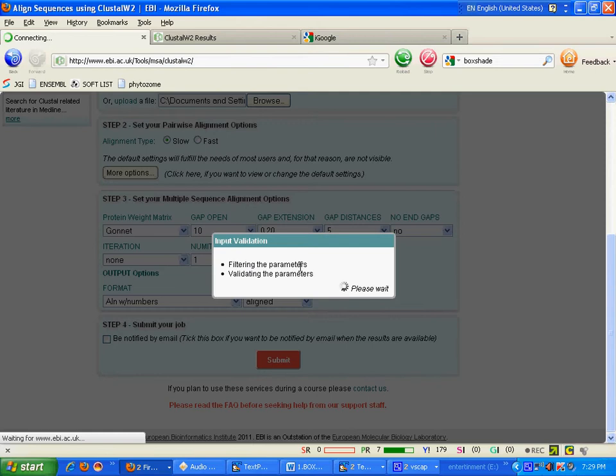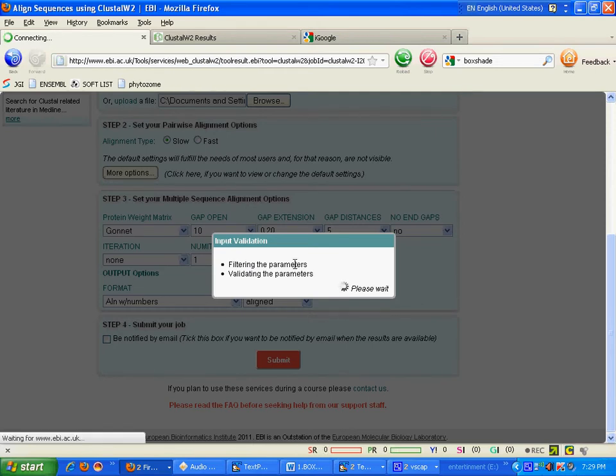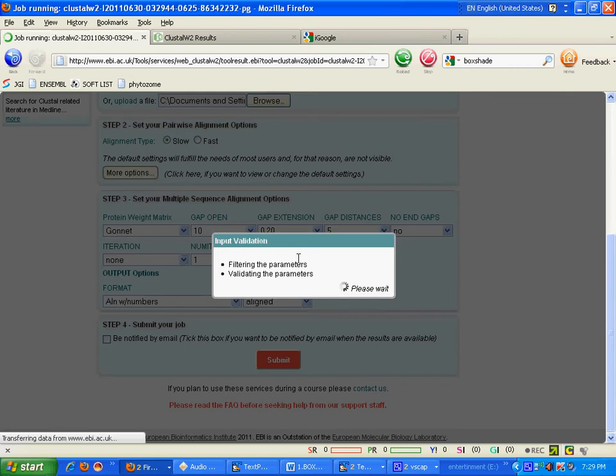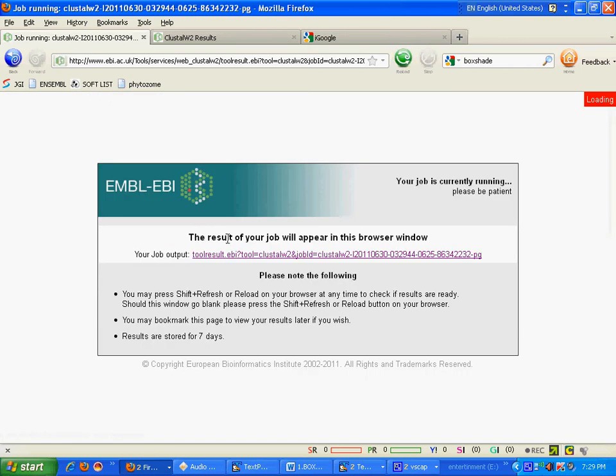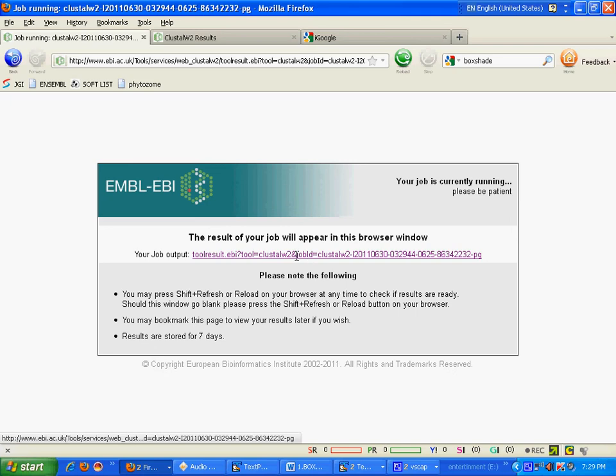Wait for some time. It will take few seconds to complete your job. You can bookmark this link. Now wait for some time for the result.